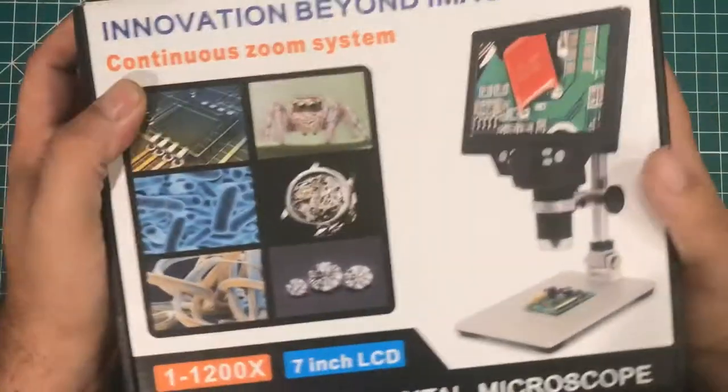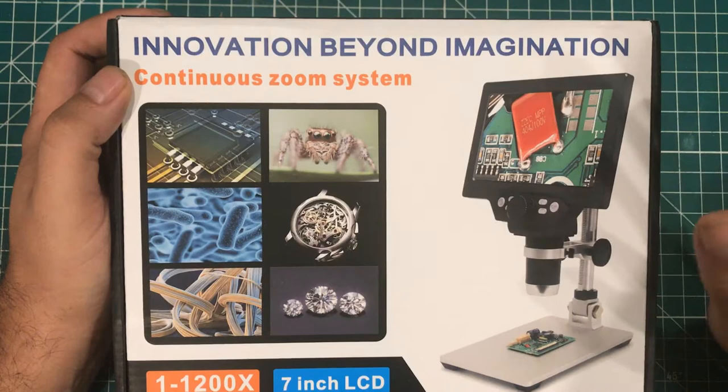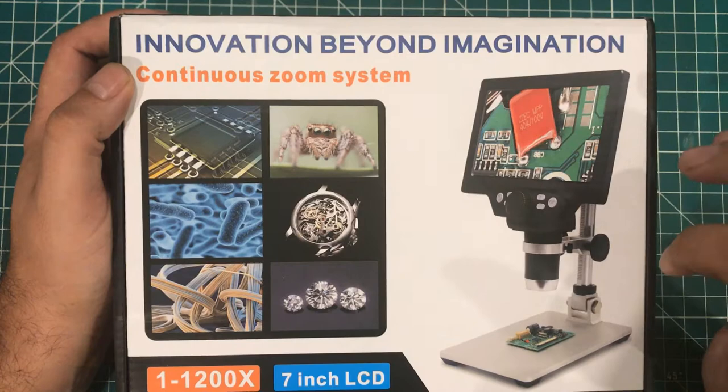Hey everybody, I hope you're having a fantastic day. I've seen on a few other YouTube channels that people are starting to use these microscopes with screens, and I always thought that looked kind of interesting.